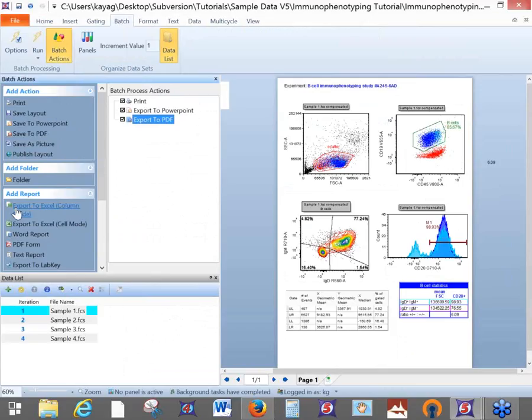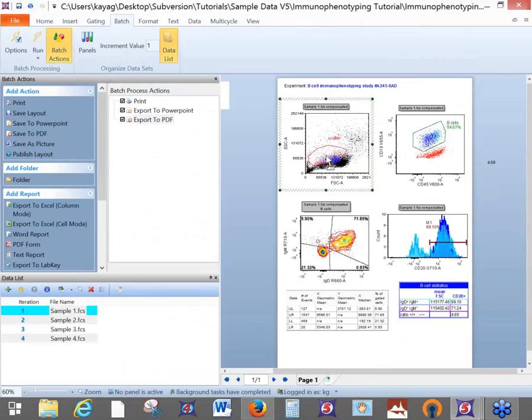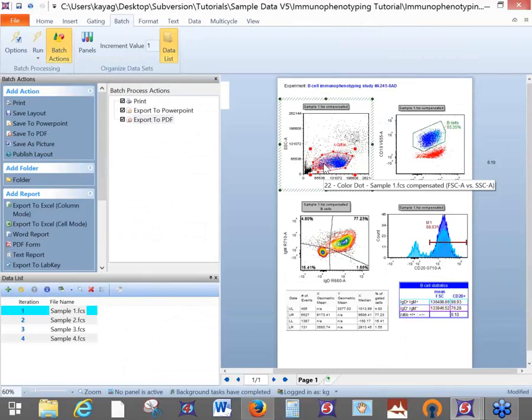We did a lot of calculations here in FCS Express together, so I'd like to encourage all of you to do as much of your work as you can in FCS Express, because then the statistics will automatically update when you move your gates. But of course, there are some cases when you might be collecting a whole lot of statistics, and maybe you need to do a downstream analysis in another program, or just need to keep an Excel spreadsheet for quality control purposes. That's what exporting to Excel is useful for. So we'll set up one of those together.